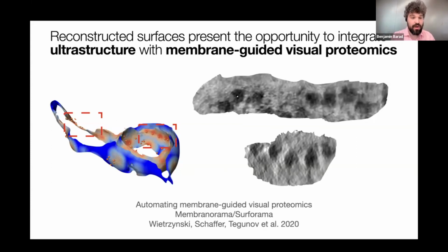And so it's really hard to solve a structure. It's really hard to find your protein without kind of knowing it's near something that you know where that is. So in this case, I'm showing you can use the membrane and you can take your surface and you actually remap your structure, kind of like unrolling an orange. And you create it so that X and Y are now along the membrane, and then Z is stepping away from the membrane.